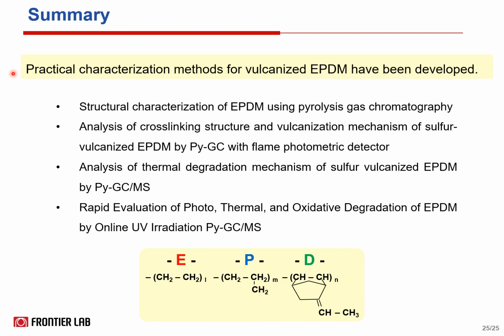In summary, I introduced practical characterization methods for vulcanized EPDM. Py-GC or Py-GCMS techniques can be applied to not only EPDM but also other rubber material developments, competitors' product analysis, product quality assurance, or failure analysis of your products.